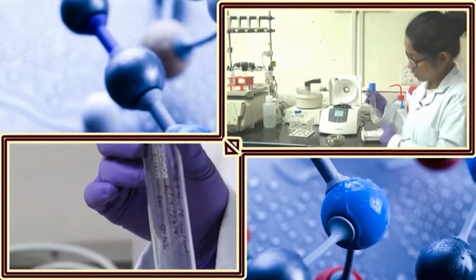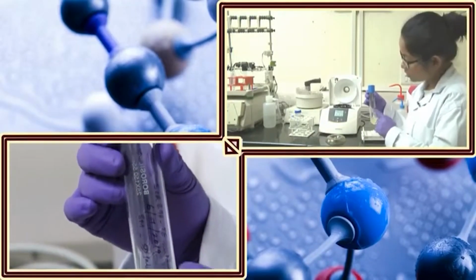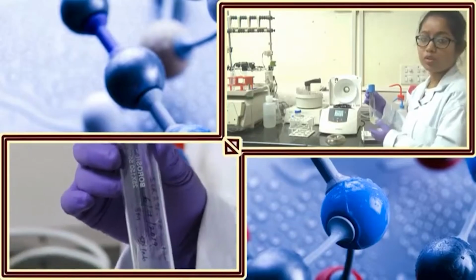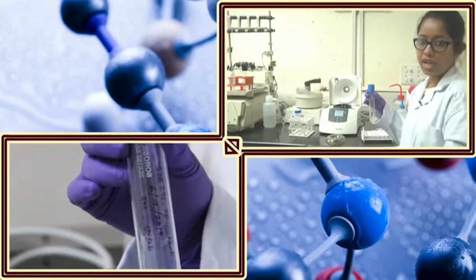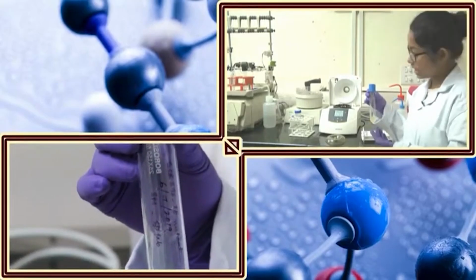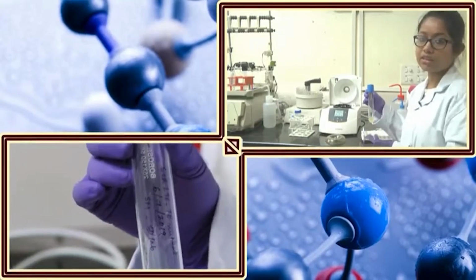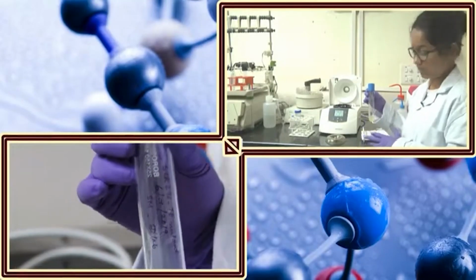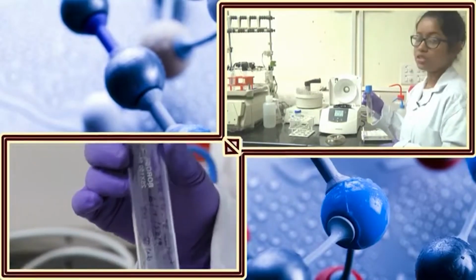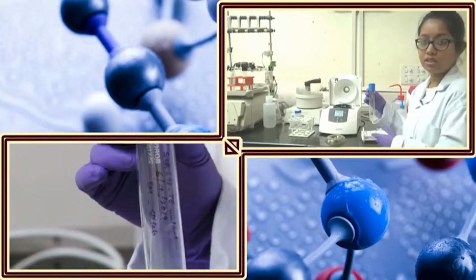So, yesterday night I put the culture, so I have given the sample name, also the date, and also I have written my name, because when you are working in a lab there will be other people, and if you do not label your sample properly or write your name, then it might create a problem, like people might take your sample, or there might be some kind of mishandling of the sample. So for that purpose you should always properly label your sample, put down the date and also your name.